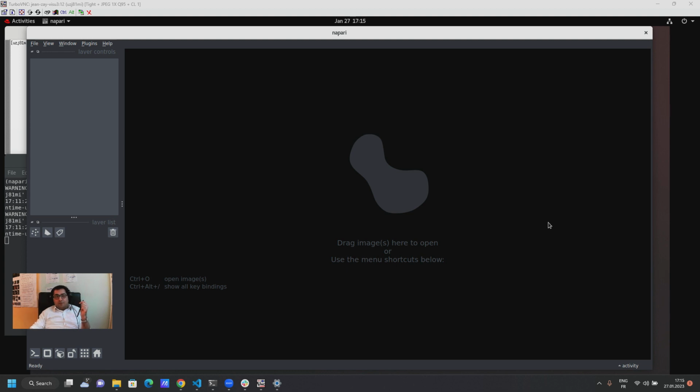to write for fulfilling the grant requirements, but it's already in production, which means that I have given it out to researchers to use it on their data and get the analysis. So I'm just going to show you the steps which I expect would help you to analyze the dynamics of these microtubules in different experimental conditions.